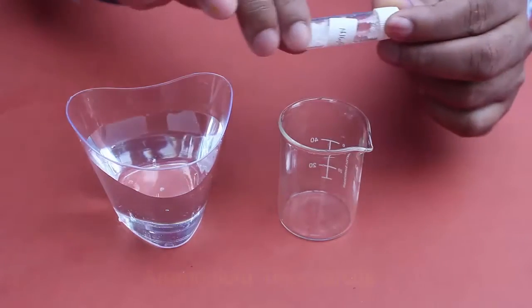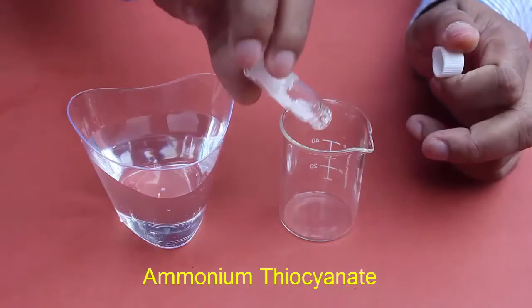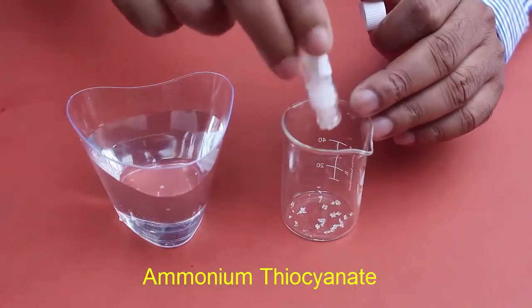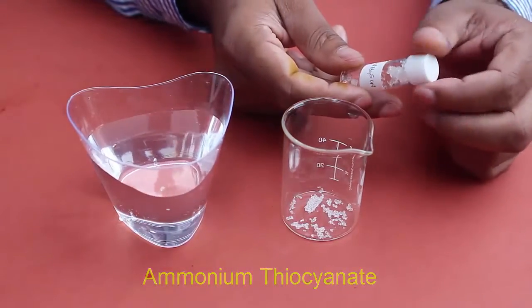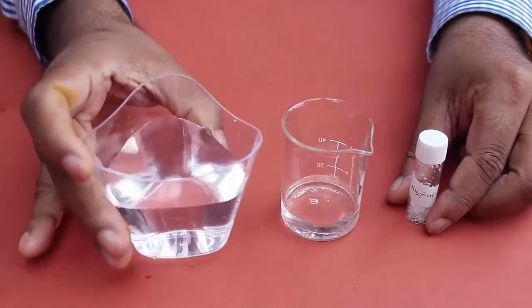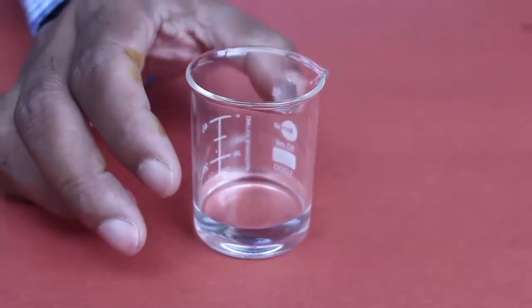First, place some crystals of ammonium thiocyanate in an empty beaker, then add a bit of water and keep stirring the mixture to prepare a clean and saturated solution of ammonium thiocyanate.